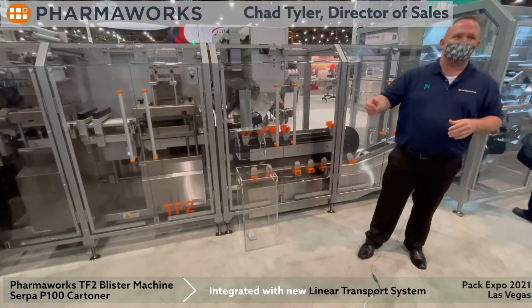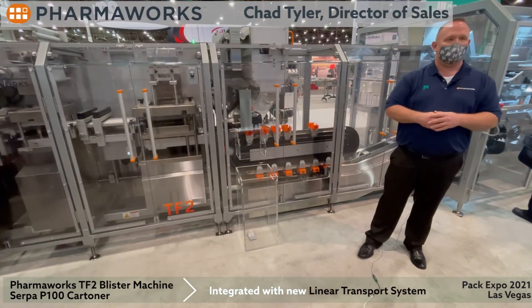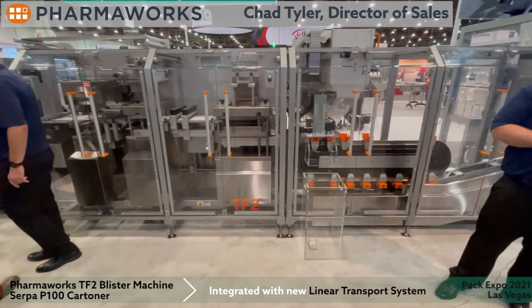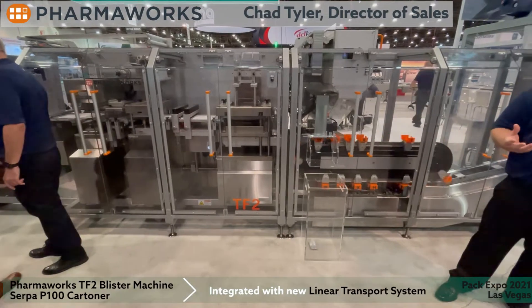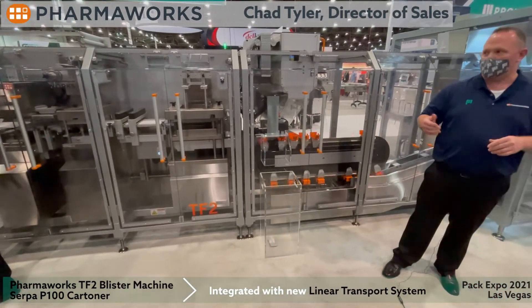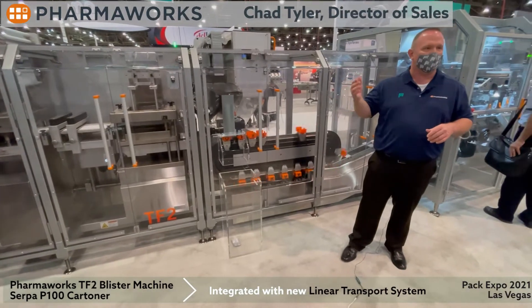Our TF2 is our medium-sized blister machine. It's very good for medical device, pharmaceuticals, animal health, and consumer goods. It has a very nice deep draw, so you can do thermal form or cold form. You can run printed material — pre-printed — or we can print on demand.